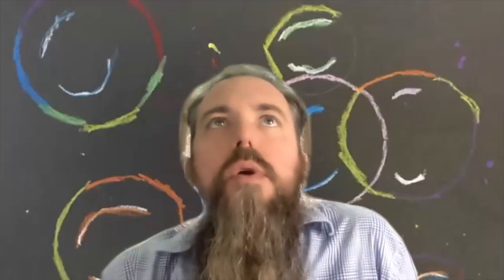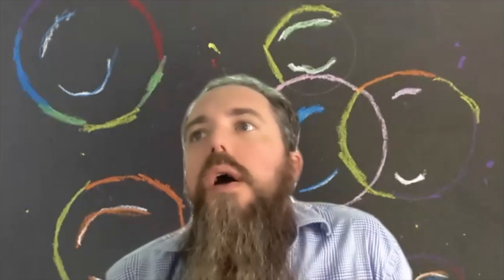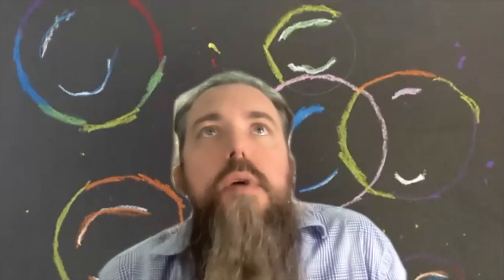Do you, Ken? Well, we've done some of that work, but we always do some form of separation before we would look at the material in plasma, just because the EVs are a very small minority in plasma compared with lipoprotein particles and other extracellular particles that are in much higher concentrations, orders of magnitude higher. Unless you're able to do phenotyping, it's difficult to really understand what those different populations are if you go with an unseparated and especially an undiluted biofluid.